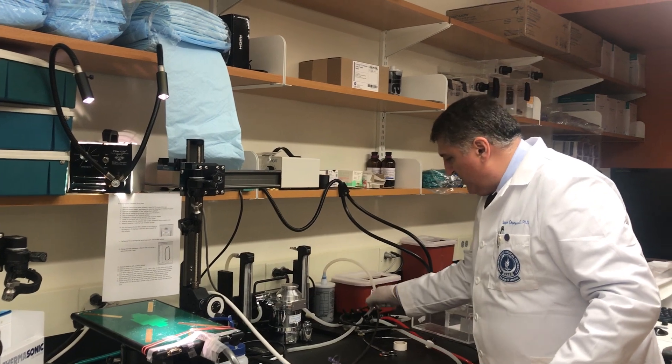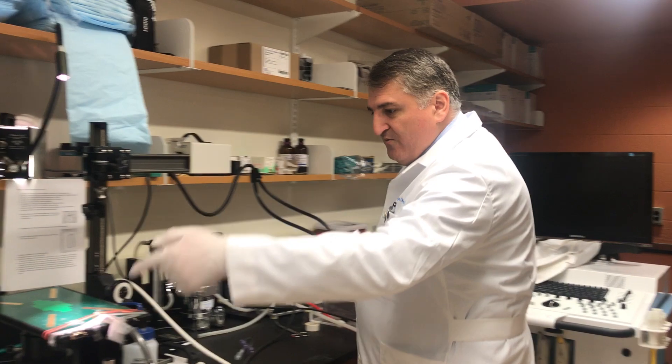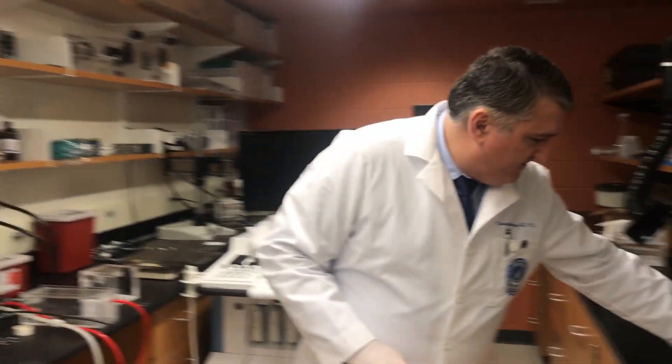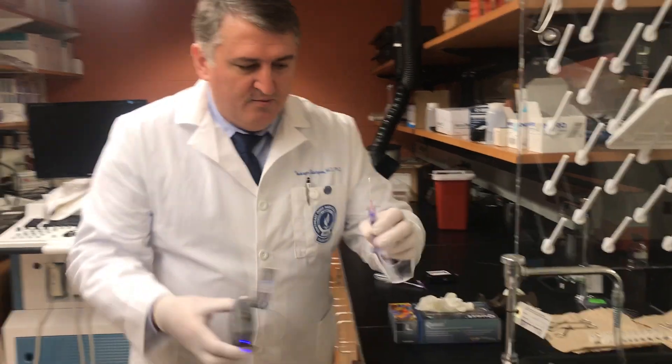This is just a simple and common system for isoflurane to knock down the animal in this box, and then move here, and then using the fiber system, and then we will intubate.